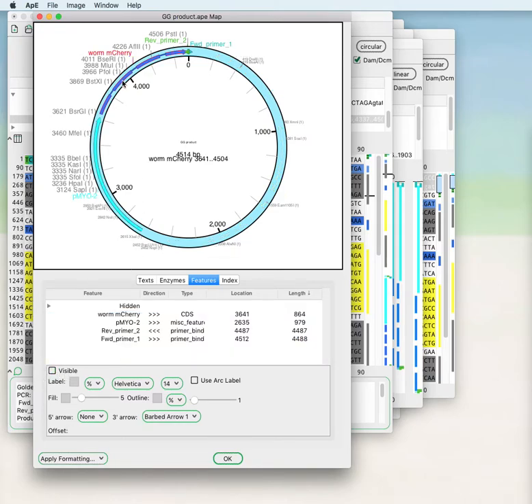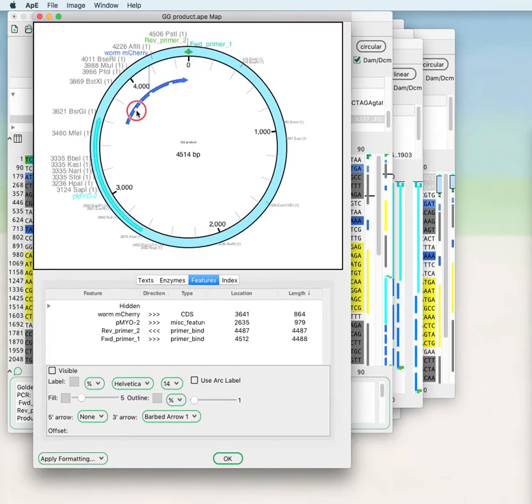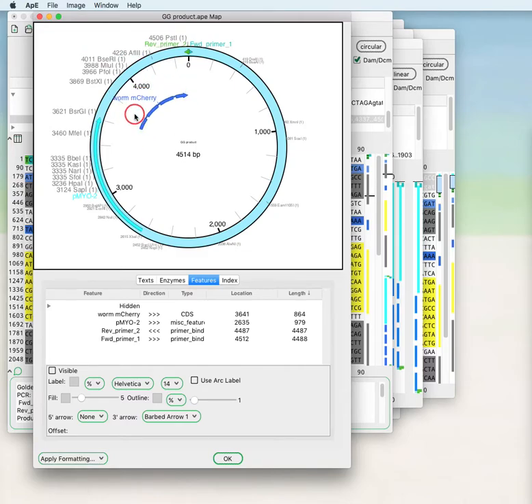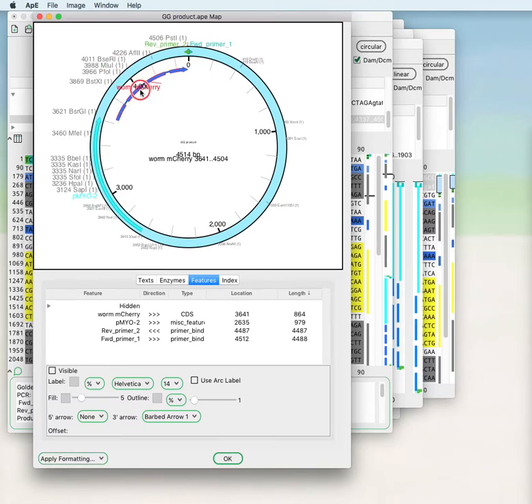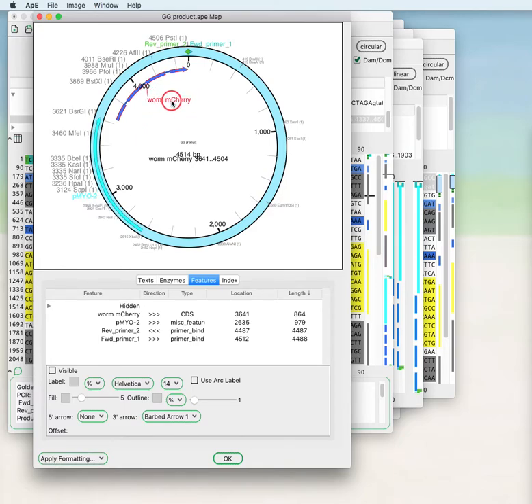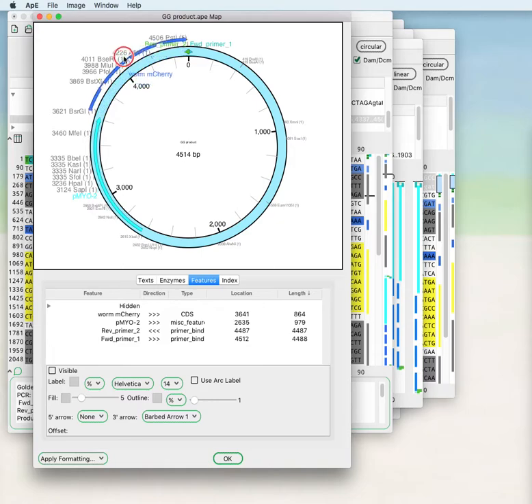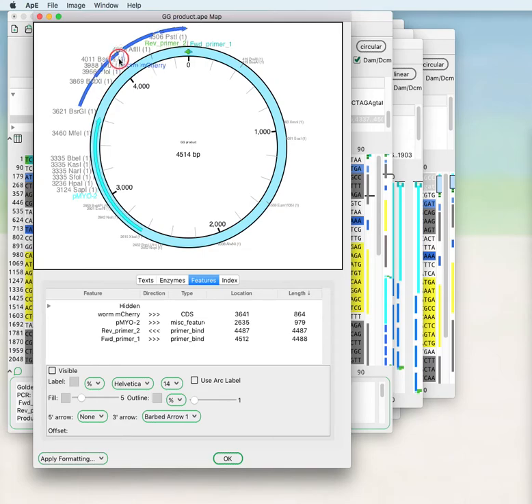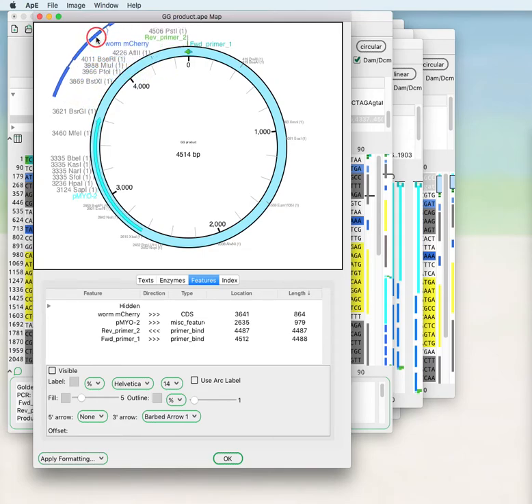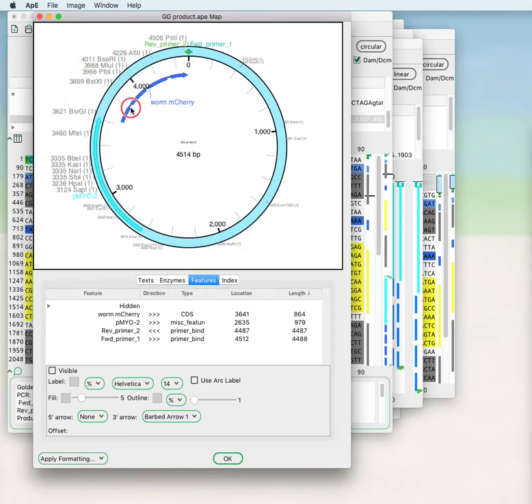You can hold down the command key and drag the feature radially. You can hold down the command key and drag the text of the feature separately, and it will maintain its relative position when you move the feature. You can see that texts move themselves so that they don't overlap.